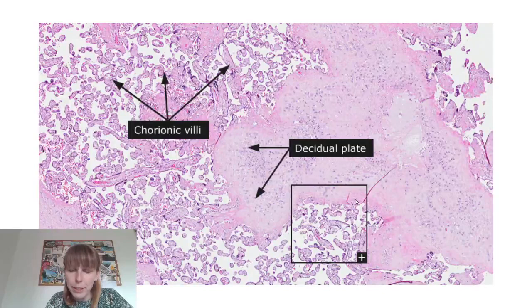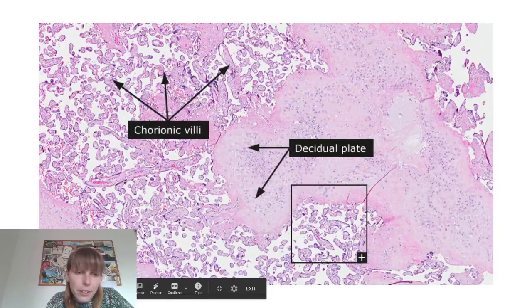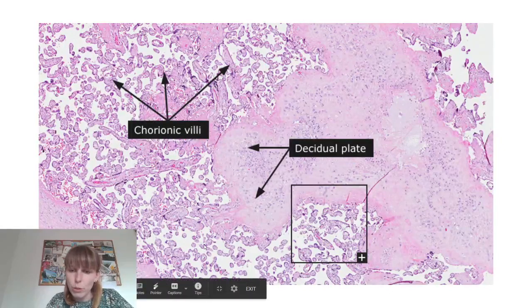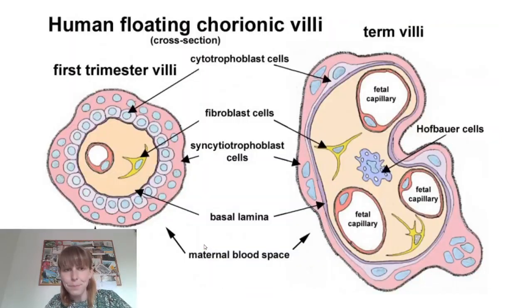but we will move into a higher magnification, and here you see the chorionic villi. So the placenta is very different from all the other slides that we have seen, because it's a lot of empty space, and inside it these cloudy structures with quite loose inside usually, so quite light.